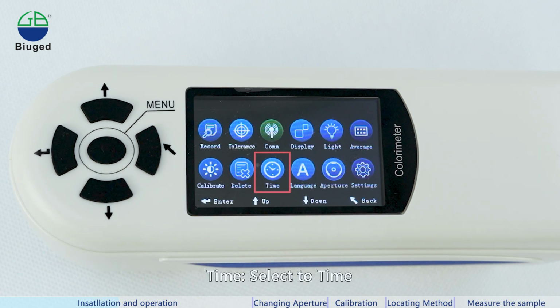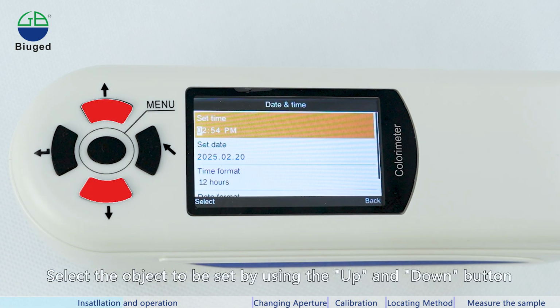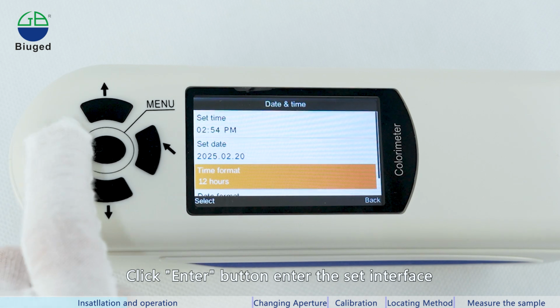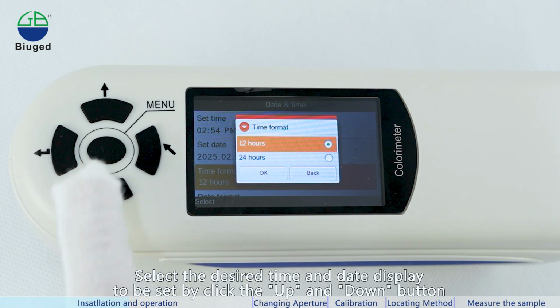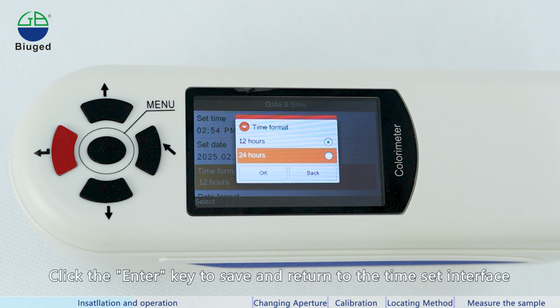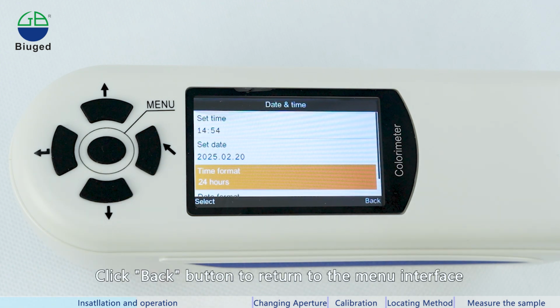Time, select Time. Click the Enter button to enter the time setting interface. Select the object to be set by using the up and down buttons. Click the Enter button to enter the set interface. Select the desired time and date display to be set by clicking the up and down buttons. Click the Enter key to save and return to the time set interface. Click the Back button to return to the menu interface.